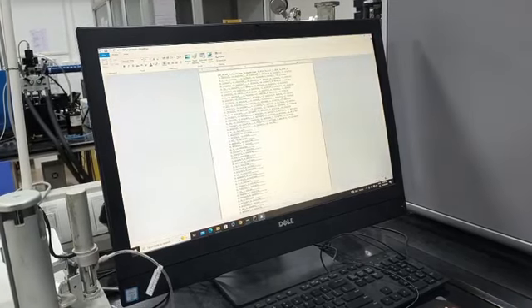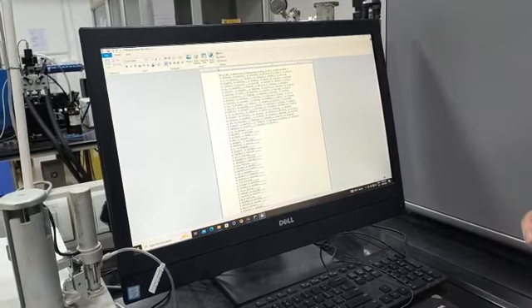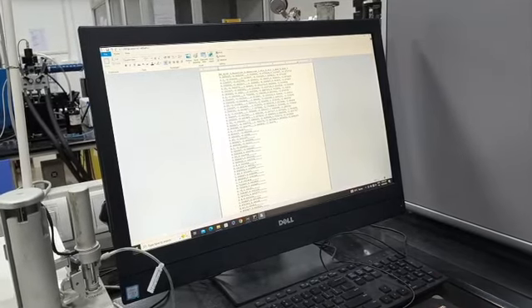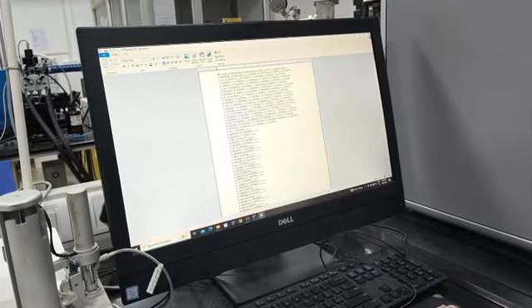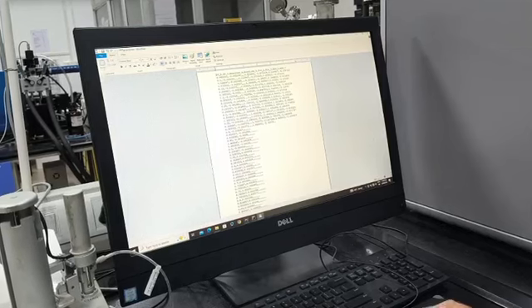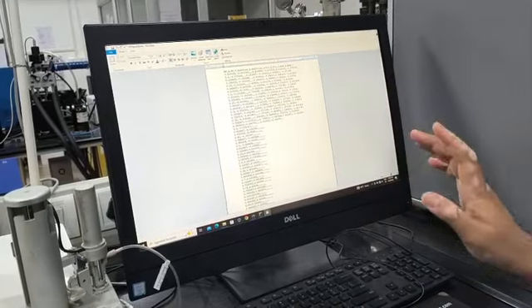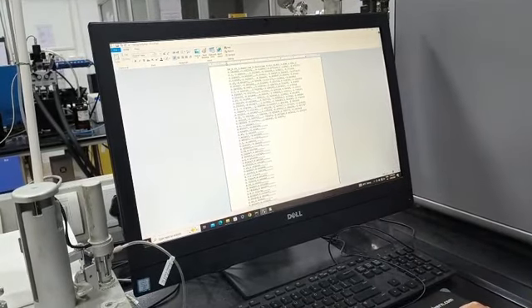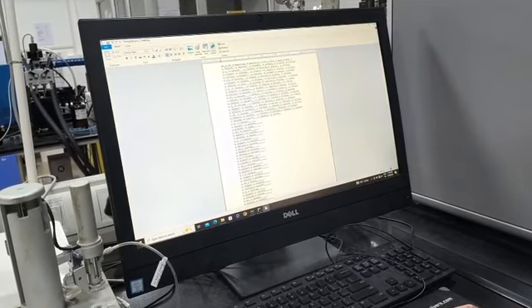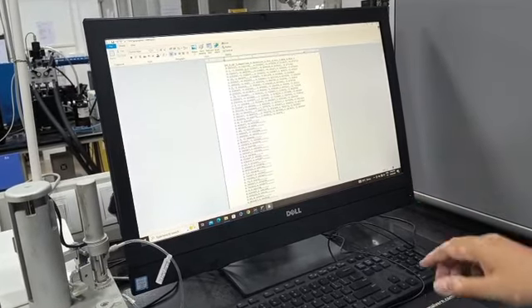Now next, these are basically the fitting. So whenever you are going to plot this, just remove this, this is first x y, remove these three things, then plot. You cannot get this fit from Origin because the instrument has its own algorithm to fit this. If you want this, just graph these points, so you have to remove 1, 2, 3. This is x and this is y, delta H and molar ratio, these two are columns.